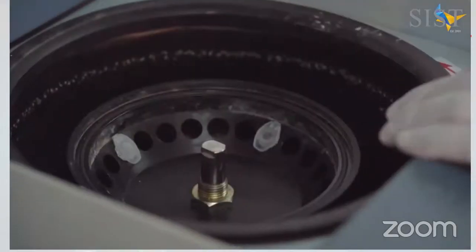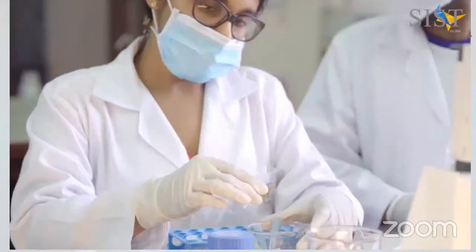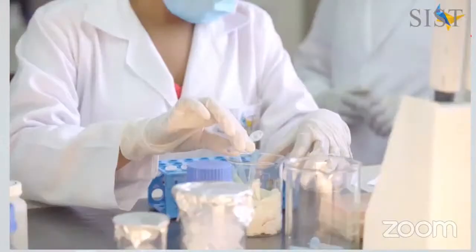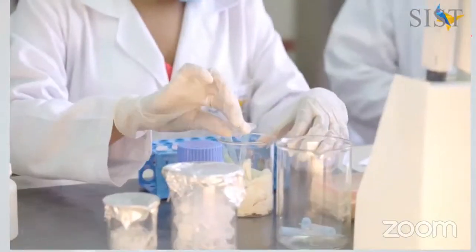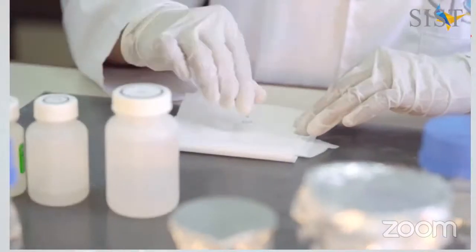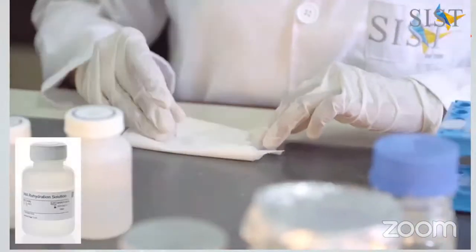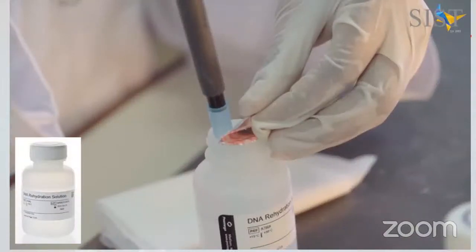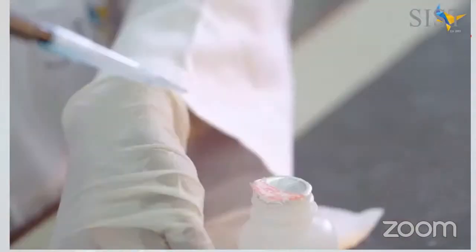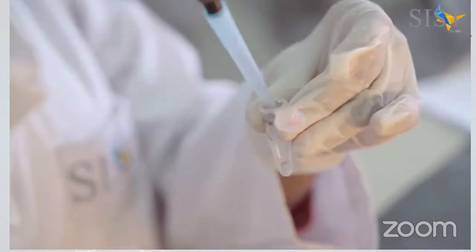The supernatant is again discarded and the resulting pellet is blot dried and air dried before adding the last solution, which is the DNA rehydration solution. When the pellet is very well dried, the DNA rehydration solution is added. Upon adding the DNA rehydration solution, the DNA will dissolve in it, which can then be kept for long-term storage at 4 degrees Celsius or at minus 20 degrees Celsius. Thank you.